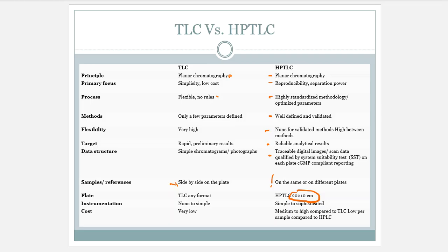Most of the time it is 7 centimeters or a 70 millimeter stop. Why do you go to 20? You don't need to go to 20 because the stopping point here is 7 or 70 millimeters. So don't be that person. Cost, very expensive, of course, for instrumentation.